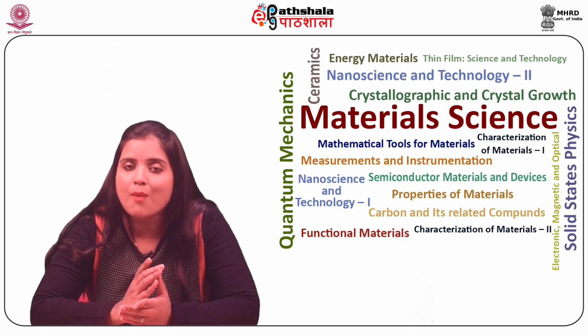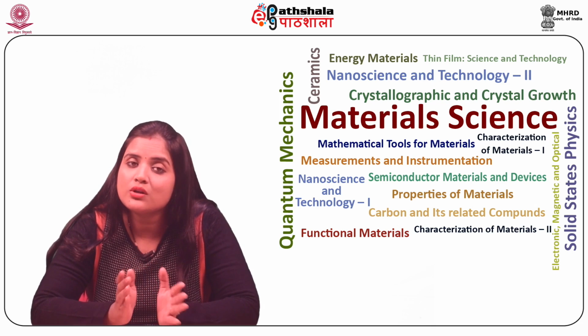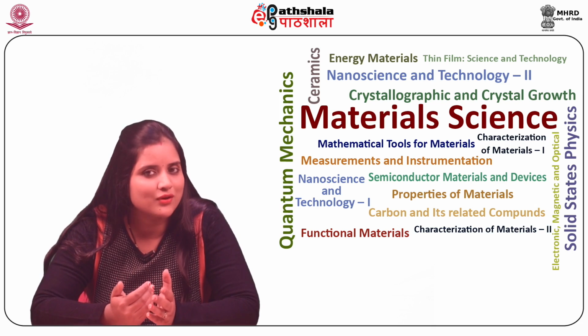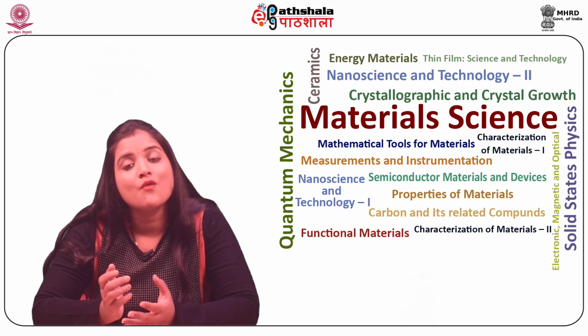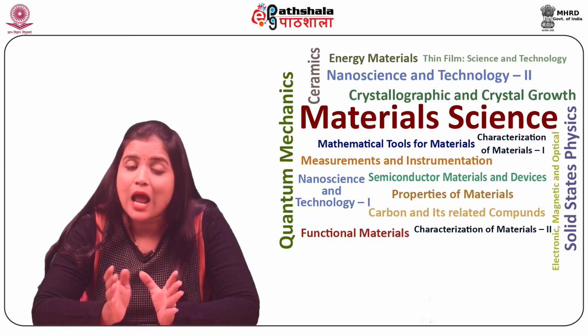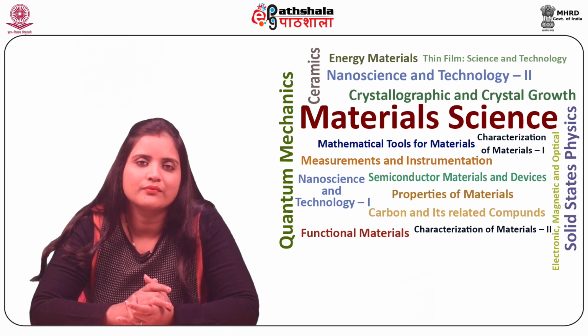Thus, wave propagation simulation is fundamental to the working of digital holography. After computing the desired field, physical devices can be used to produce and display it.